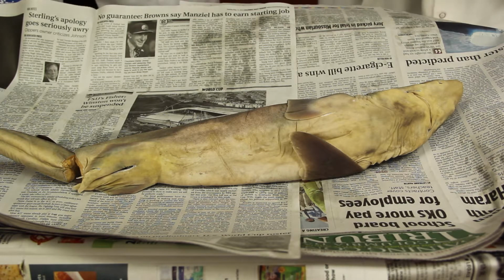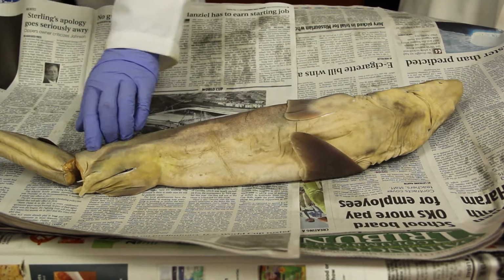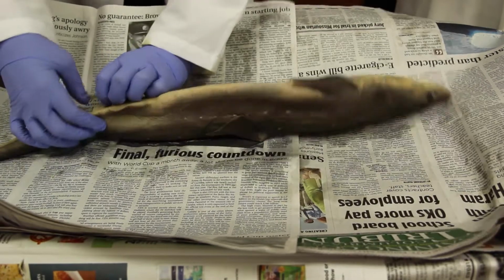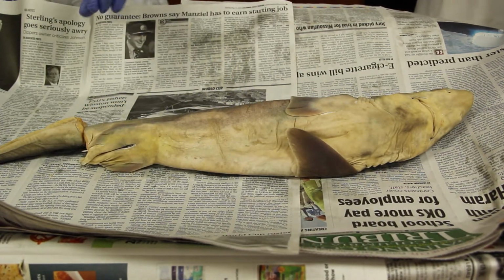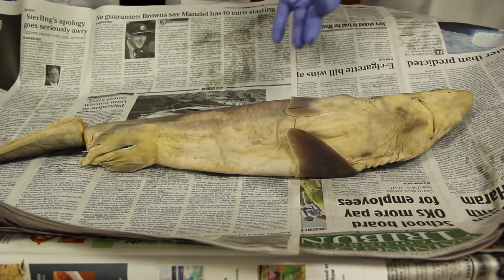Sharks practice internal fertilization, and so at the posterior end of the shark are the pelvic fins, like I said before, and then they're modified into these claspers, which they can use to start the reproduction process. Unlike most bony fish, sharks are K-selected reproducers, meaning that they produce a small number of well-developed babies.